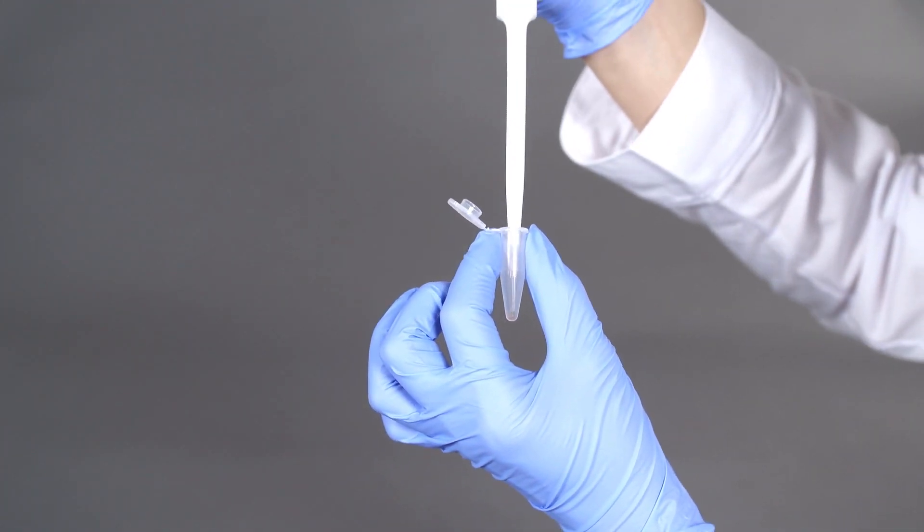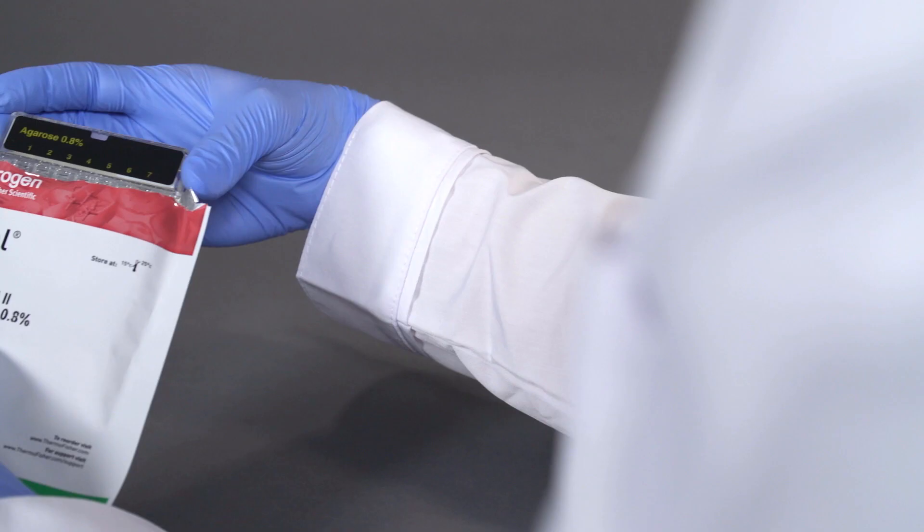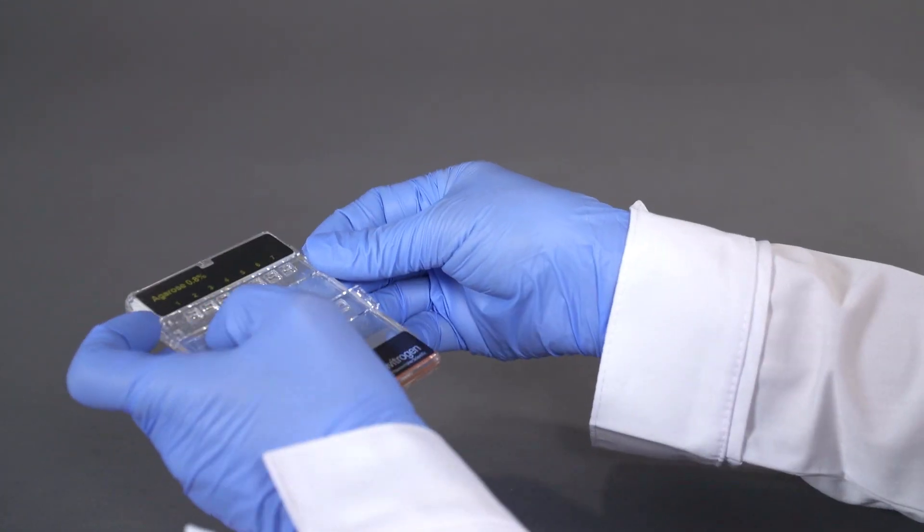Before the run, prepare all your samples in 1x sample loading buffer provided with the gel. Remove the eGel from the package and remove the combs.